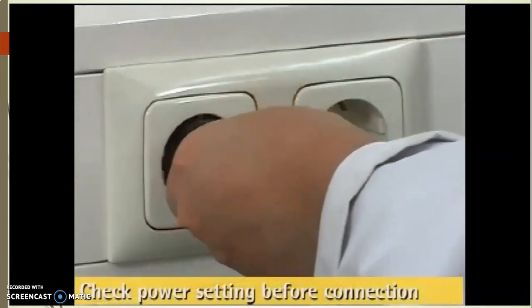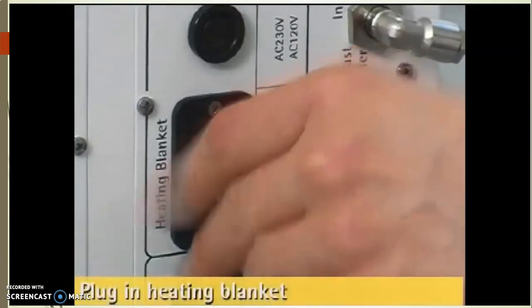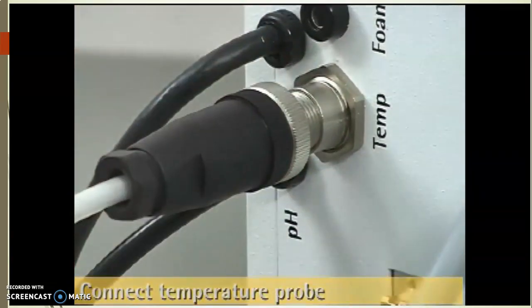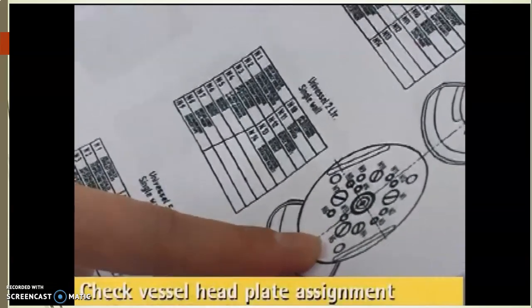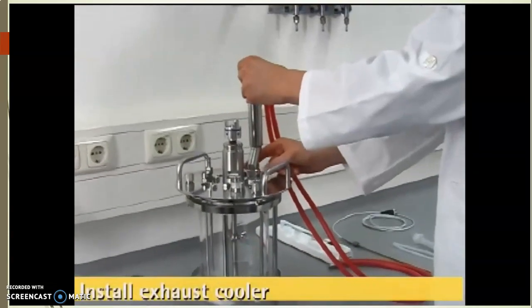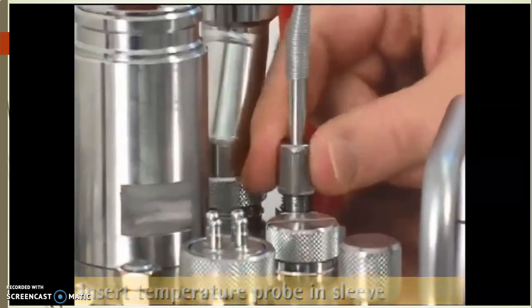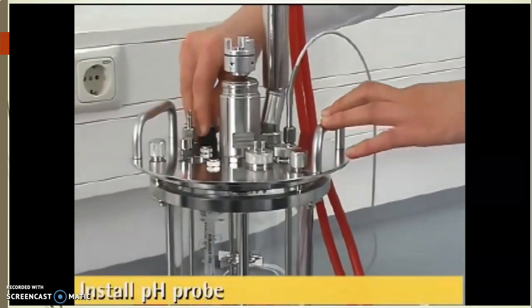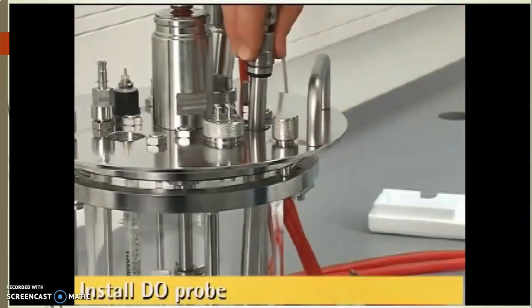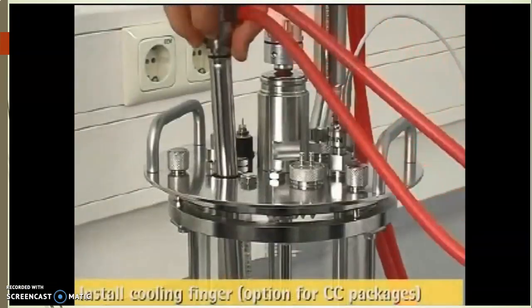Then the power supply. After that, we need to check whether the power supply is okay or not. Then the Ethernet connection between the PC and the machine. After that, the heating blanket. Then the temperature probe needs to be connected. These are the different parts assigned to the head plate, and this is the exhaust cooler on the head plate. Insert the temperature probe in the sleeve. After this, the pH probe, and then the DO probe.